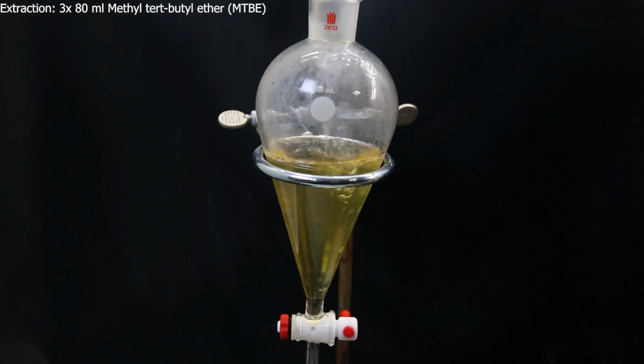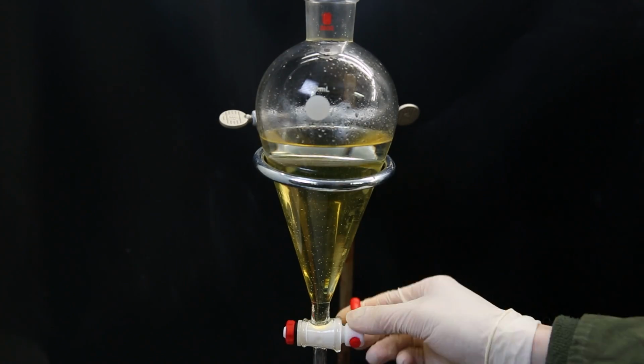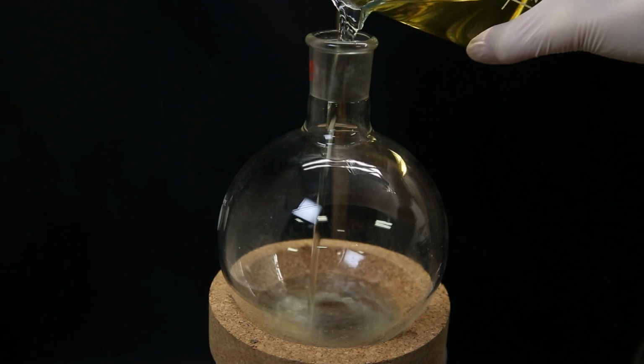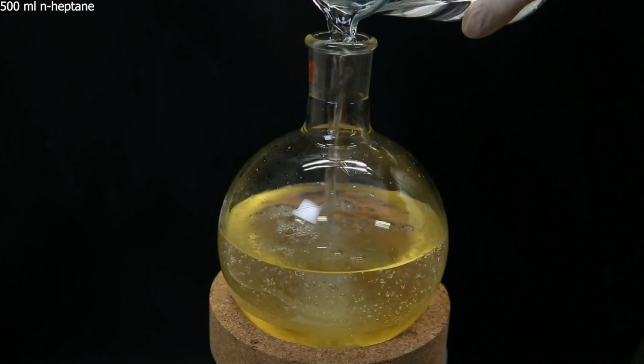I then add 80 ml of MTBE and extract the water layer to remove some organic impurities. I repeat the process 3 times and discard the organic phases afterward. I then move the water phase to a 1 liter flask and add 500 ml of n-heptane.